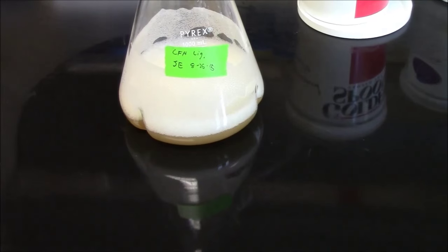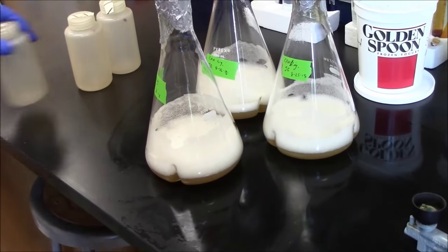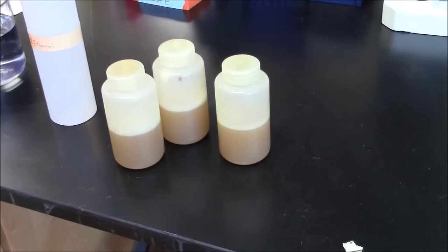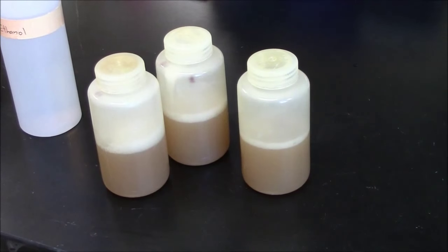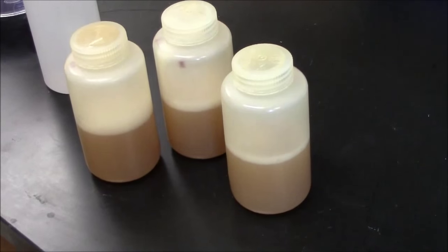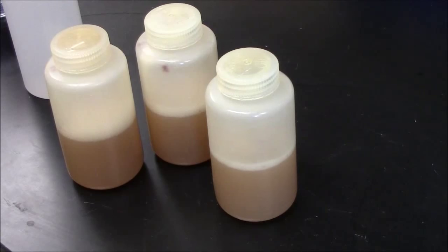This is 150 milliliters of culture in a 1 liter flask. Foam is a good sign, it means you have lots of aeration, which is important for phage growth. The material in the flask is then transferred to a centrifuge bottle. Here at UCI, these are 250 ml centrifuge bottles. In ACR, you'll use the smaller polycarbonate centrifuge tubes.